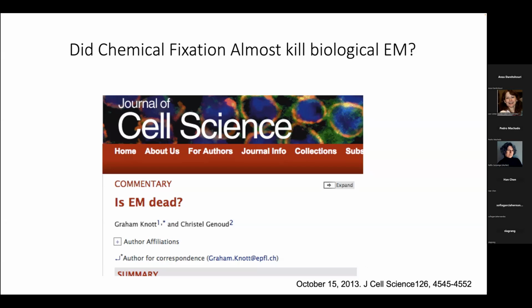A lot of this was due to chemical fixation and the artifacts it presents. When you take a cell and add glutaraldehyde and other fixatives, you change the morphology of the cell, and when you compare that to living cell light microscopy techniques, you see something different. So this commentary came out in 2013 asking a rhetorical question: is EM dead?